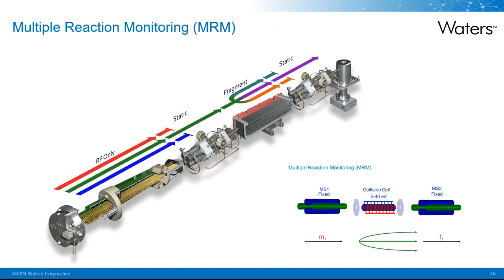Multiple reaction monitoring is a non-scanning mode used for high-sensitivity analysis of target analytes. So it is a primary method of data recording used by tandem quadrupole mass spectrometers for quantitative analysis. In this experiment, both quadrupoles allow only transmission of the specific precursor ion that provides a specific product ion for monitoring, so it's very targeted, very selective and very sensitive, because only a specific ion, which fragments to produce the specific fragment ion, is monitored for the entire data acquisition time cycle, rather than just a portion of the cycle in the case of a full scan.